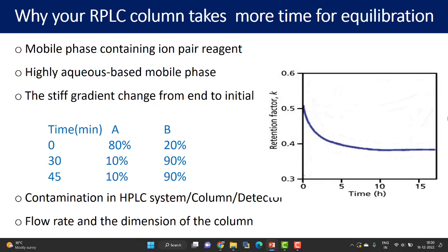Last but not least, flow rate and column dimensions can also be reasons for higher equilibration time. If your analytical method uses a low flow rate such as 0.5 ml/min, equilibration will take longer. Rather than equilibrating at 0.5 ml/min, you can use 1 ml/min or a slightly higher flow rate first to equilibrate the column, then move on to analysis at 0.5 ml/min. Similarly, a 250 mm column will require significantly more equilibration time than a 50 mm or 100 mm column — using a higher flow rate for larger columns will help achieve equilibration in the shortest time.